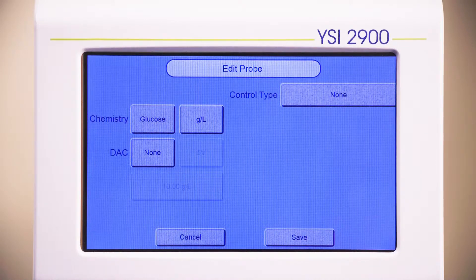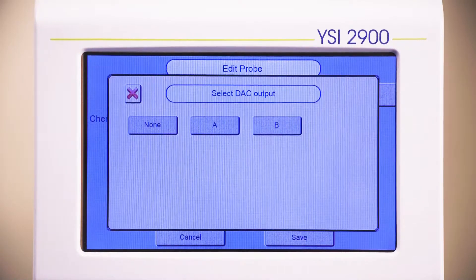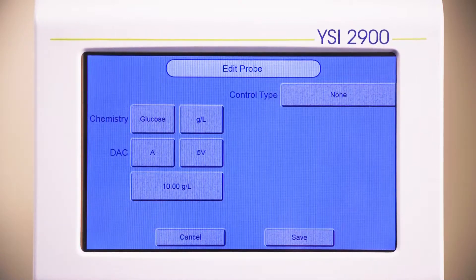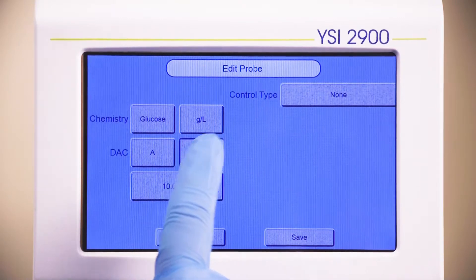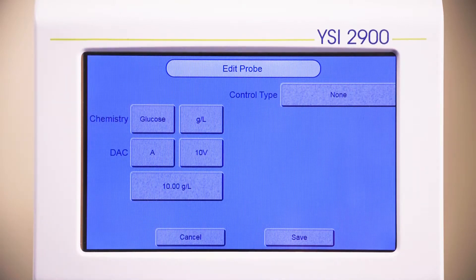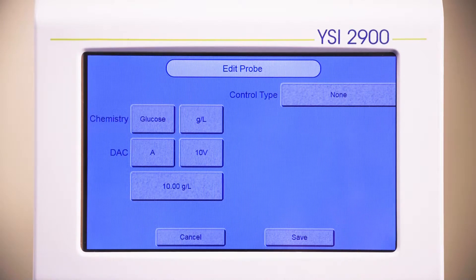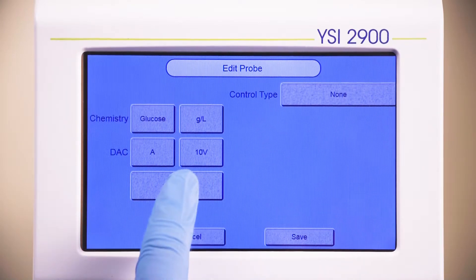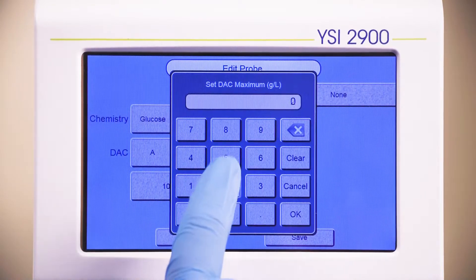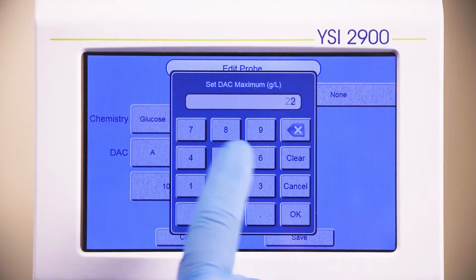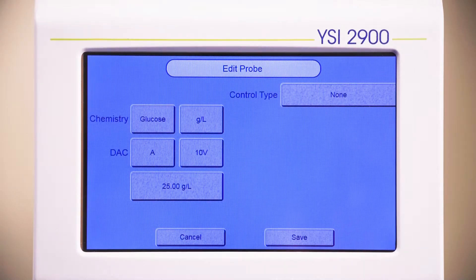If you want an analog output signal, press the button next to DAC and select an output channel A or B. Select the button to the right of the DAC channel and select Full Scale Voltage. This can be set to 5 volts or 10 volts. The concentration listed below the DAC channel is the DAC maximum. Set the DAC maximum to correspond with the maximum concentration.